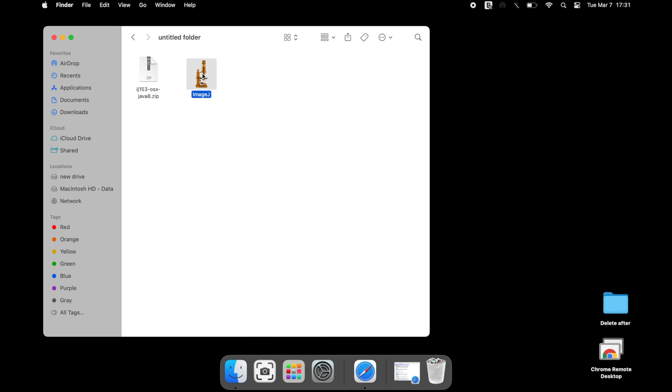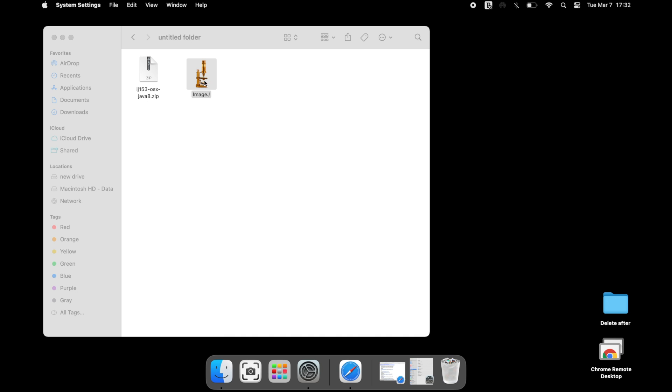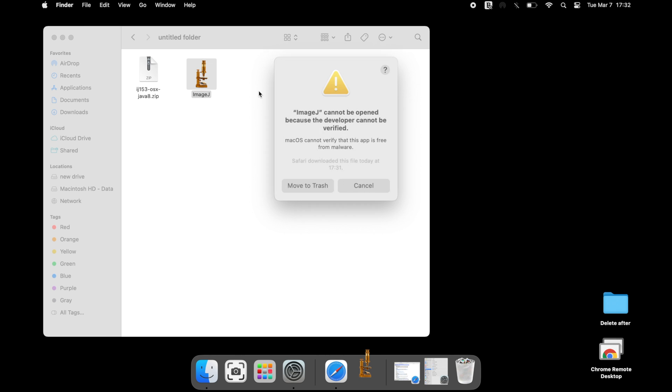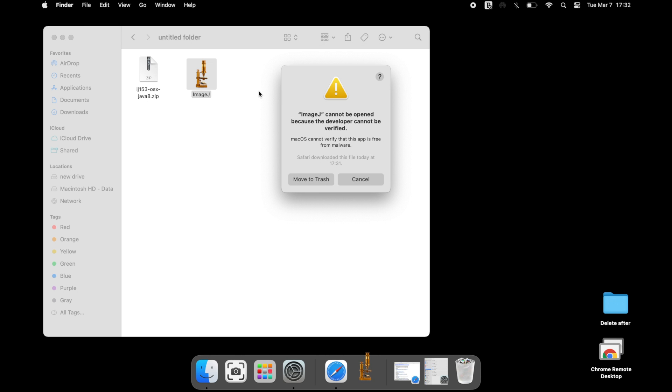The ImageJ icon displays when the file is successfully extracted. Make a double left click on the icon. A warning message may pop up at this stage regarding the software verification. Click cancel.